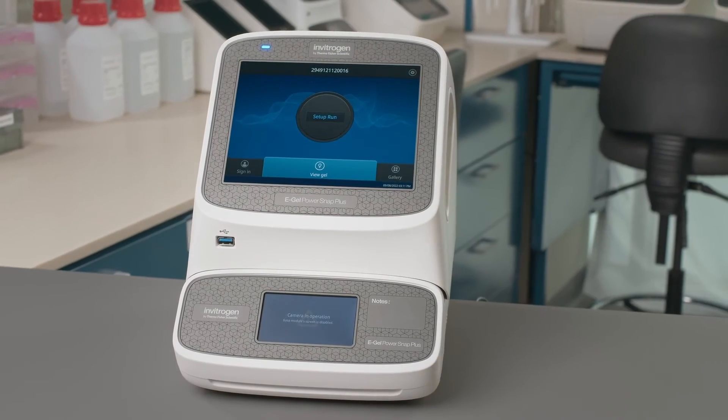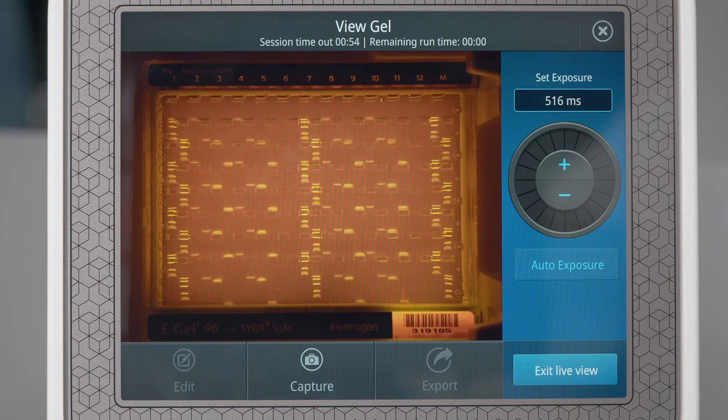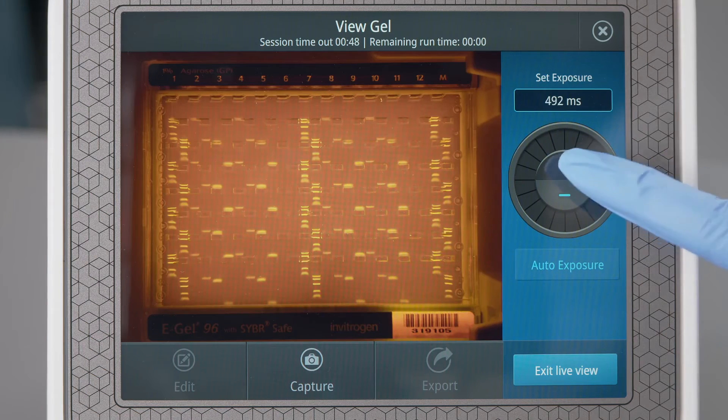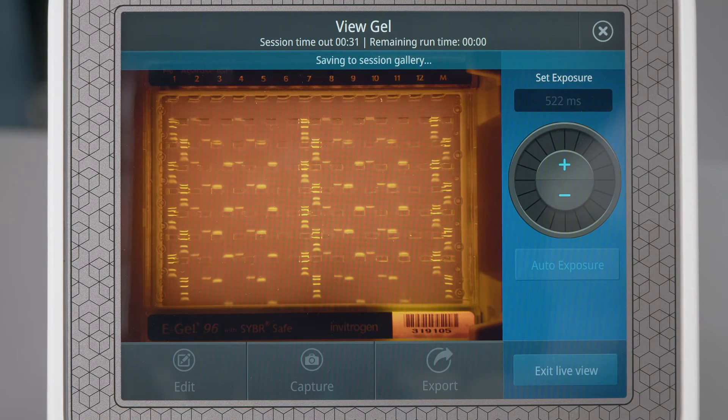Capturing images is also easy. Just select View Gel on the camera. The instrument determines the optimal exposure for your experiment. However, you can always adjust it to your preferred settings. When you are happy with your results, just select Capture and your image will be saved in the gallery.